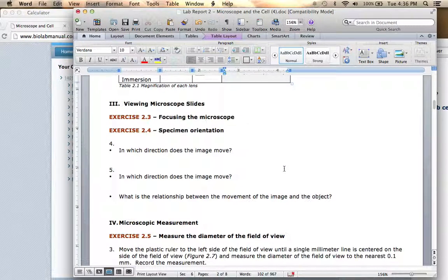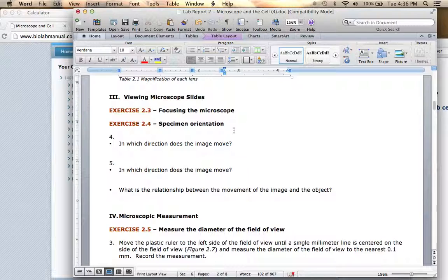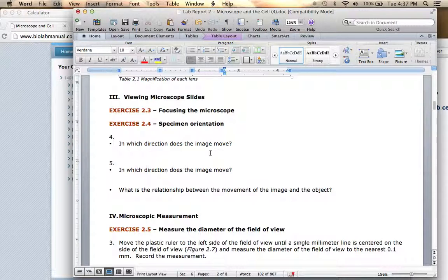The next section is going to be viewing microscope slides. What you'll notice — and I know this is a bit unusual since you're not actually focusing and looking at a microscope yourself but watching a video — is that the image you see through the eyepiece is actually moving in the opposite direction from the direction the slide itself is moving.